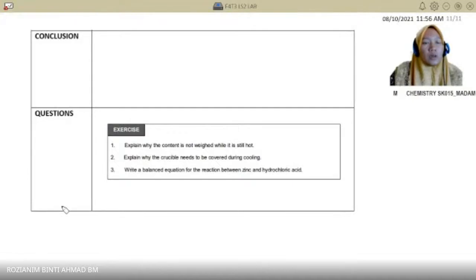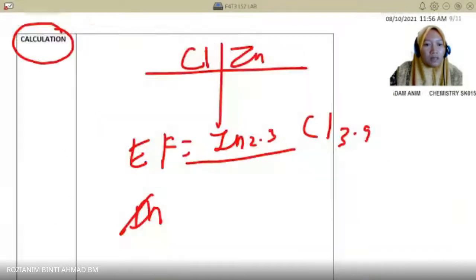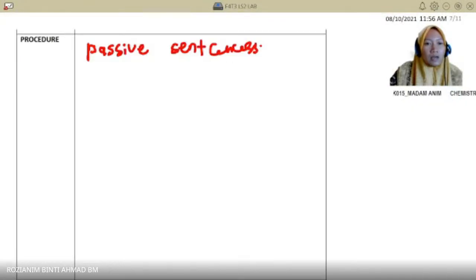So, which is according to the conclusion. For your information, conclusion dia adalah answers the objective. So, kita trace dah tadi, we have 2 objectives, means you have 2 conclusions. Contoh, objektif yang pertama tadi, dicerita pasal apa objektif pertama? Sekarang kita buat conclusion. Ayat conclusion adalah ambil daripada ayat objektif.